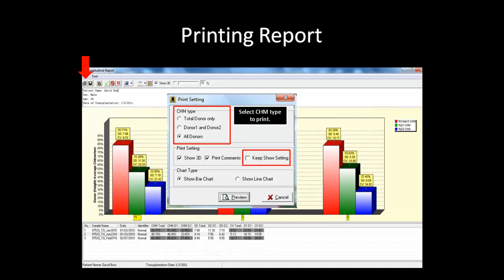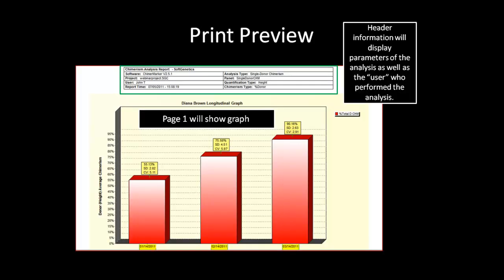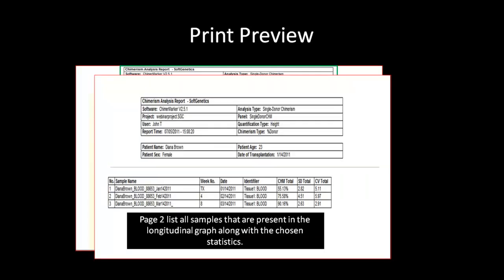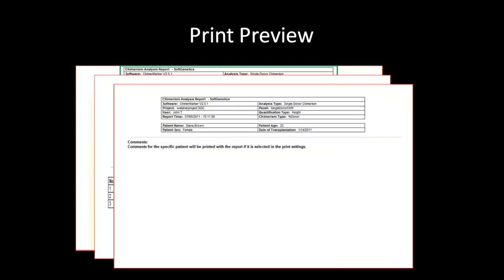Click on Preview to see a preview of the report before printing. Page 1 of the print preview will show the chimerism longitudinal graph along with the parameters chosen to be displayed. The header at the top contains information about the project parameters as well as the user who performed the analysis, given that user management is set up and the analyst is signed in. Page 2 will display the same header information, patient information, and a table listing all samples in the longitudinal report with a few statistics. Page 3 will display the patient comments added in the patient information dialog box.